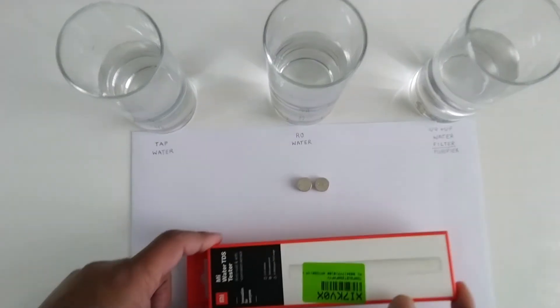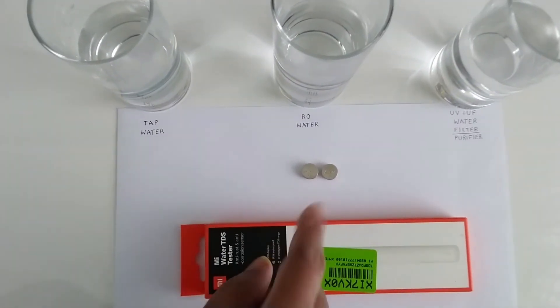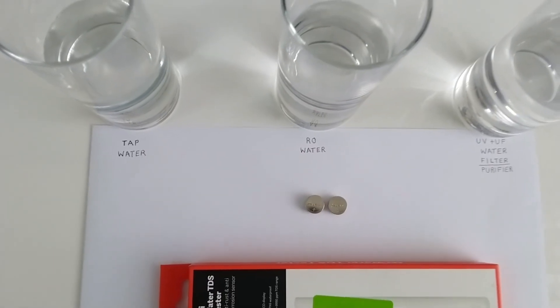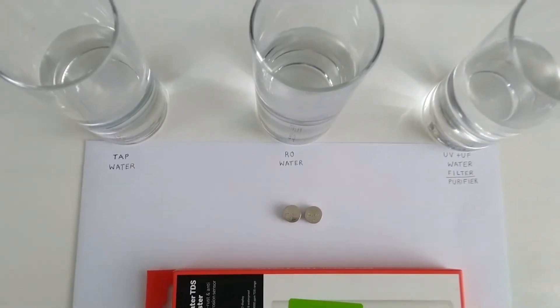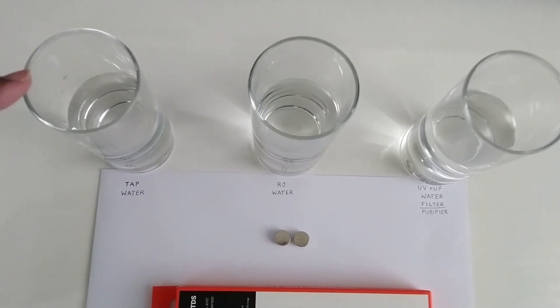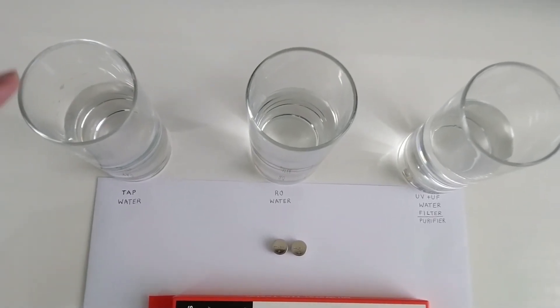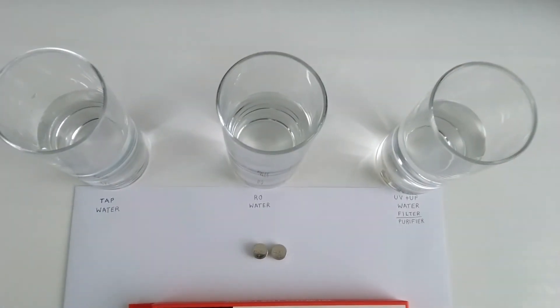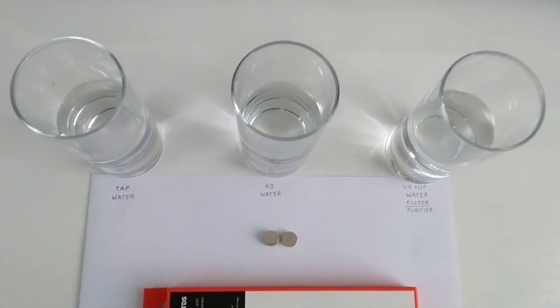I have kept two LR44 batteries ready because the box says batteries are not included. I also have three water samples — one from the tap, one from an RO tap, and one from a UV-UF water purifier.